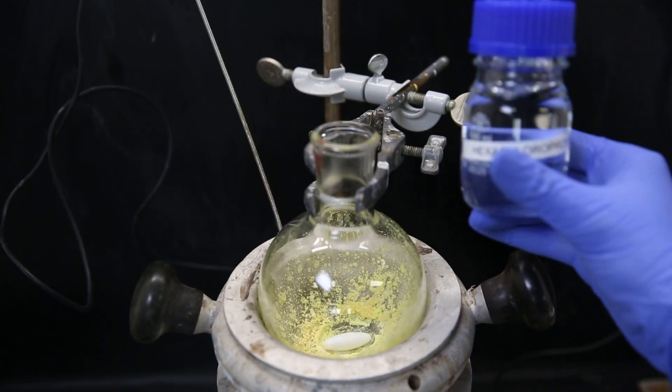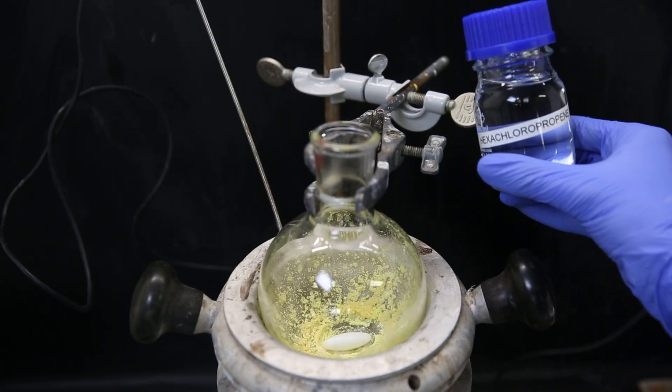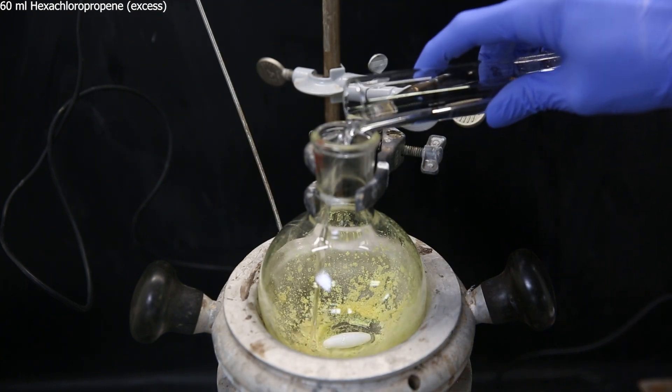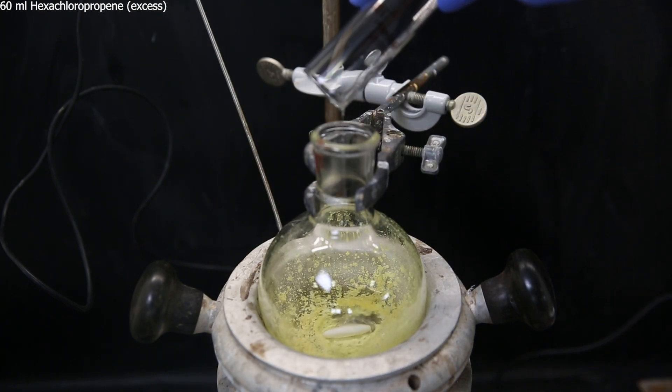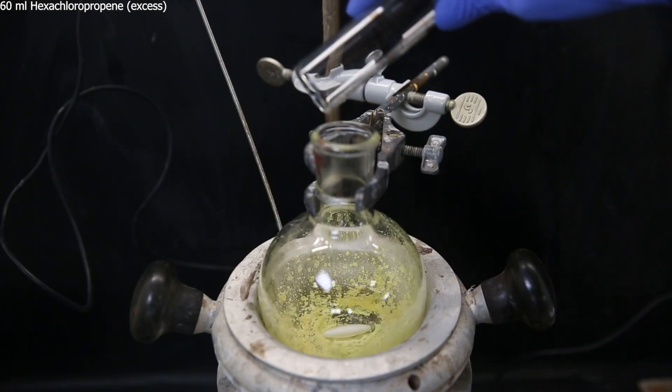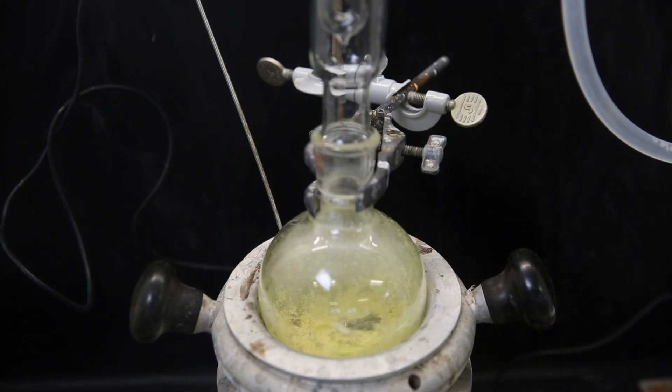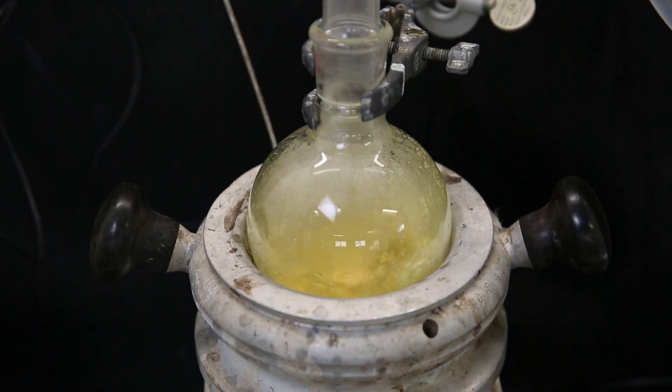So now it is time to use the hexachloropropene that I made, which I stored in a flask in the fridge. So I add 60 mls of hexachloropropene to the flask. And we see the uranyl nitrate is not soluble. To initiate the reaction we have to heat it strongly, so I attach a condenser and start heating the hexachloropropene to its boiling point, which is 210°C. When it gets hot enough, the uranyl nitrate starts to come loose and it begins to discolor.